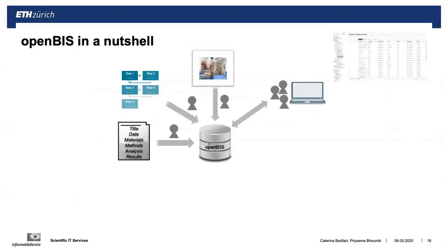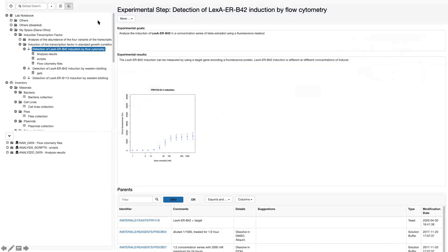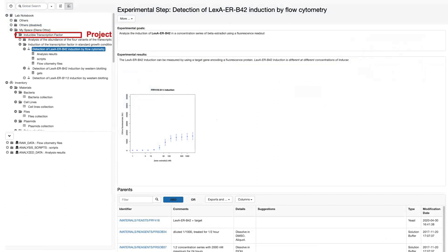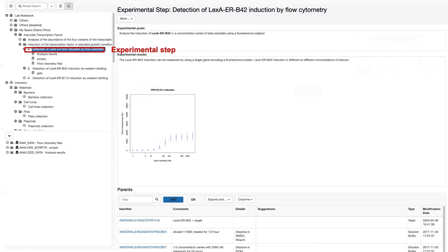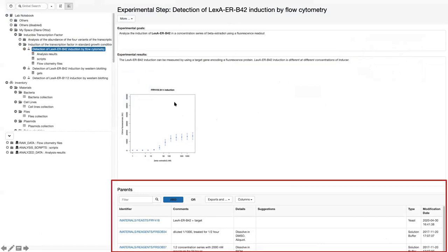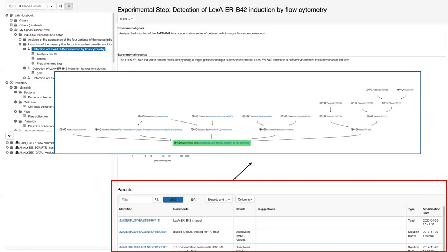OpenBIS can also be used as an electronic laboratory notebook to describe your experiments. In the lab notebook, each person has a personal folder where they can create projects, experiments, and what we call experimental steps. Here you see a description of an experimental step with goals and results. The parents section provides links to the materials and methods stored in the inventory. This connection can be visualized as a tree, making it easy to reconstruct the history of what has been done. You can click on an experiment and see what has been generated, or click on a sample and see where it has been used.